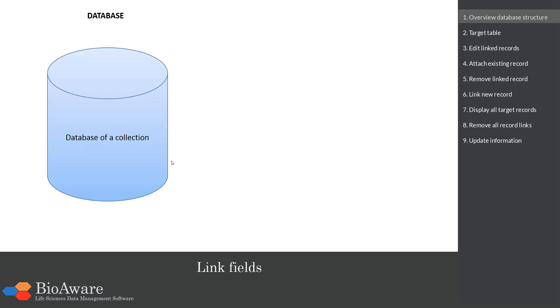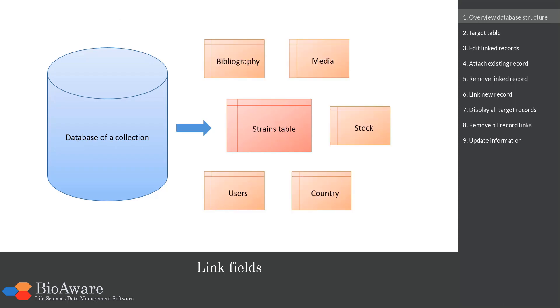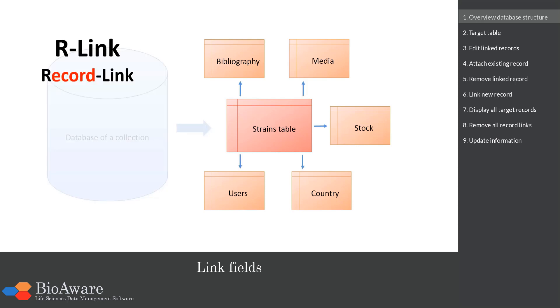Here we see the database. In the database we have a table, for example the strains table. But there can be many more tables, such as the bibliography table, the media, stock, country and the users table. The record link field, or R-link, can be used to connect the data stored in two different tables.